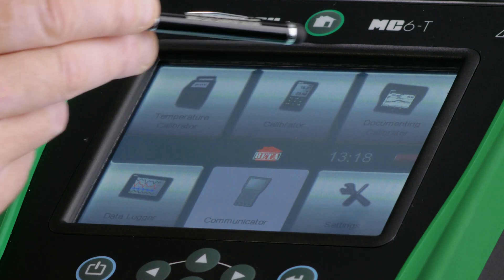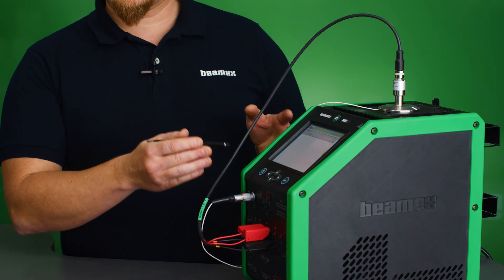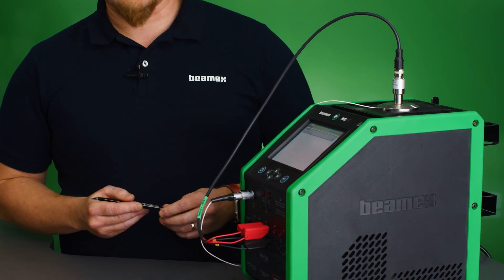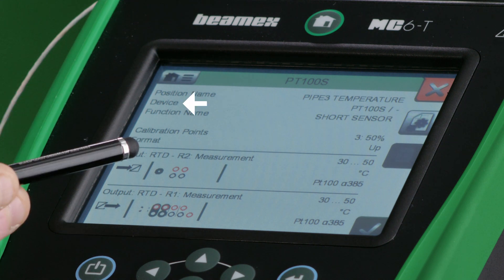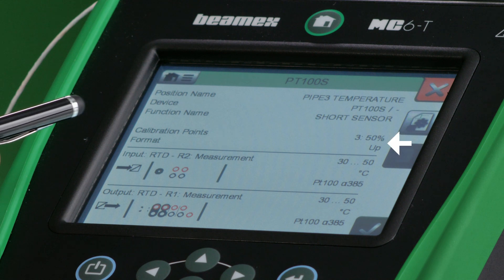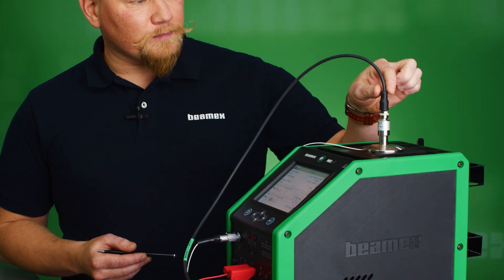Let's calibrate this short sensor. To do so, I'll go to the documenting calibrator mode on the MC6T, found here in the upper right corner. I can send my instrument to the calibrator either by generating it first in calibration management software such as CMX or Logikal, or I can manually create it on the MC6T. I've already sent it from CMX, so I can start my calibration. The information shown includes the position name, the device, and the calibration points. In this case, I'm doing three points up; my range is 30 to 50 degrees Celsius. I've already placed my special insert, my reference is in place, my short sensor is connected, and everything is ready.